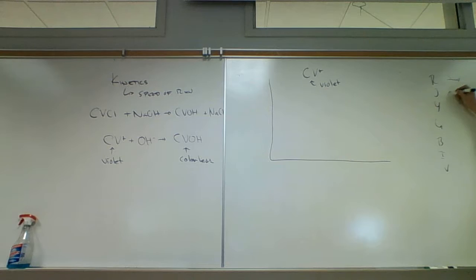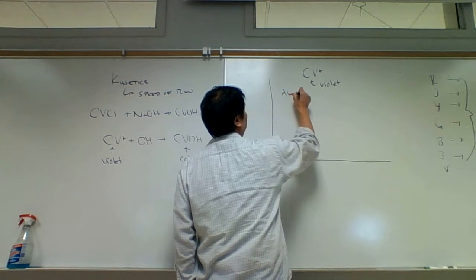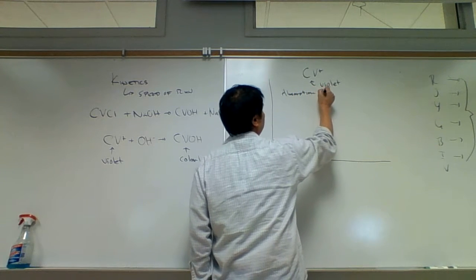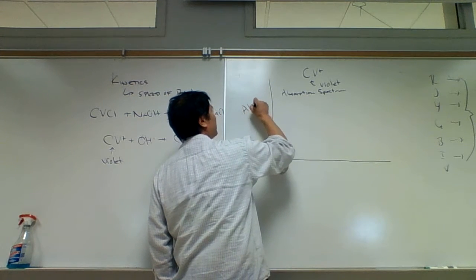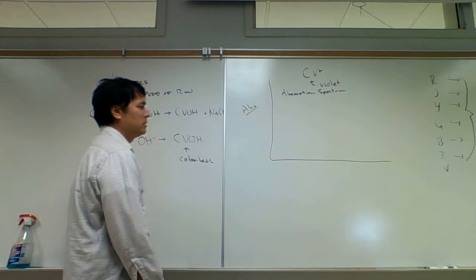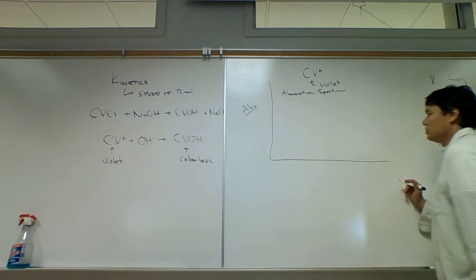Right, and so if crystal violet absorbed all the colors except for violet, and allowed violet to pass through, then crystal violet would appear violet. We could easily see this in what we call the absorption spectrum. In the absorption spectrum, we're looking at, on the y-axis, how much light's absorbed. Absorbance is dimensionless. It doesn't have units, but it does have a number associated with it.